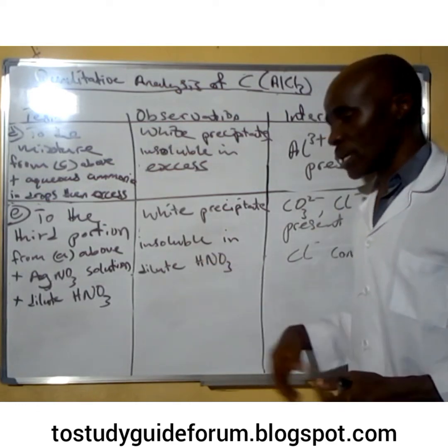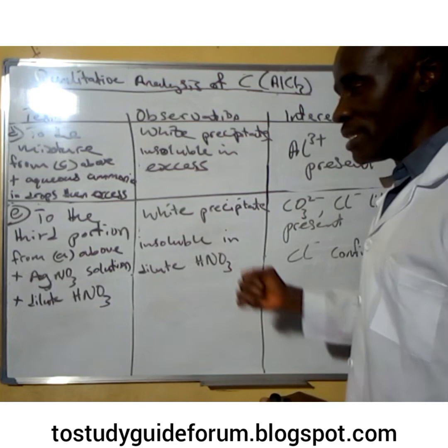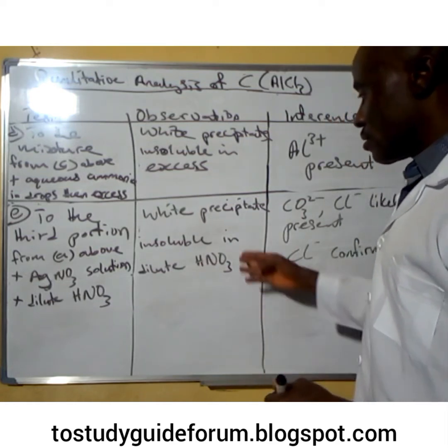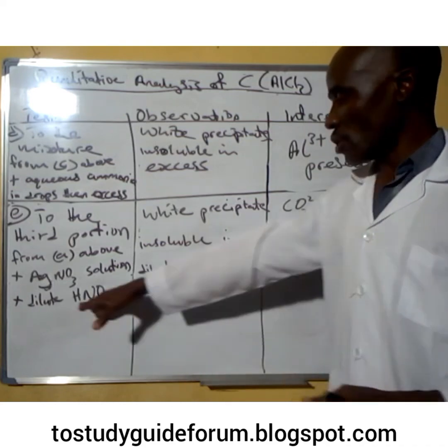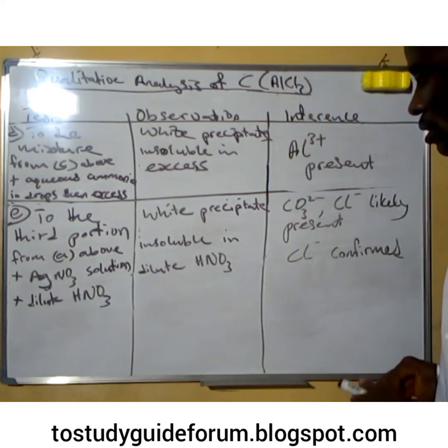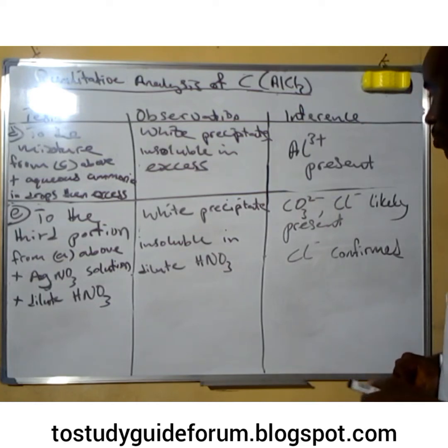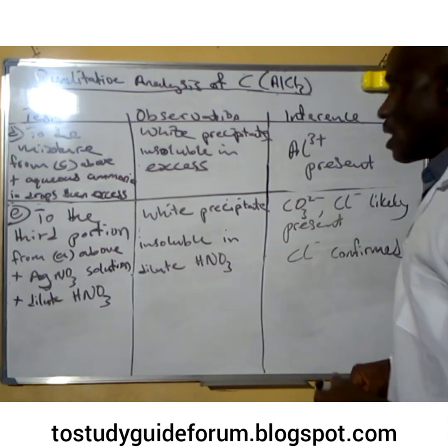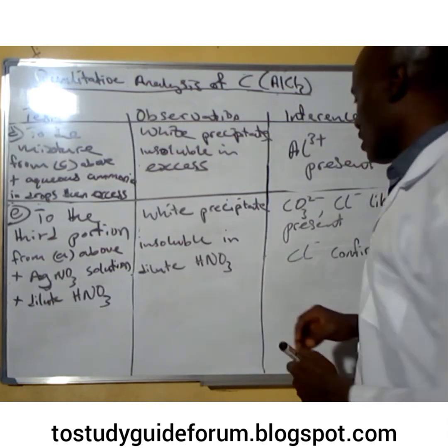Actually, this white precipitate, if you expose it to sunlight, will darken. And on addition of dilute nitric acid, we notice that it was insoluble.